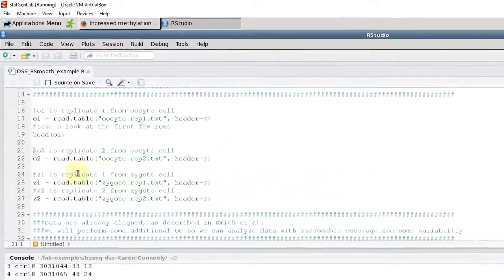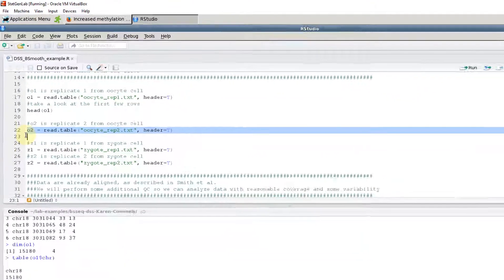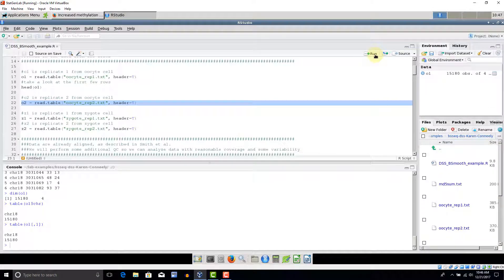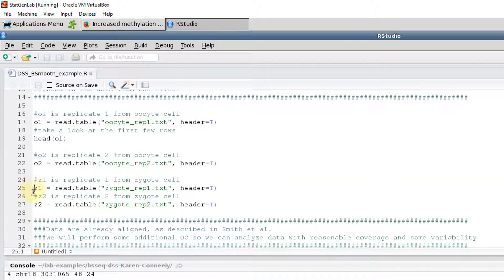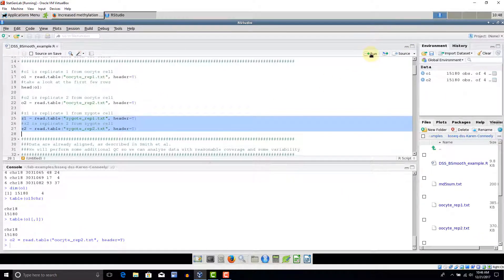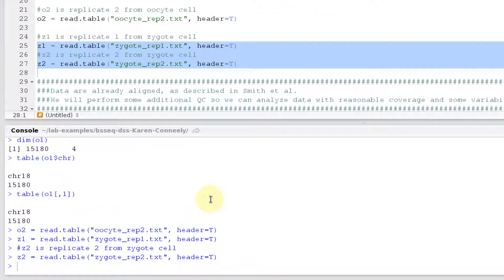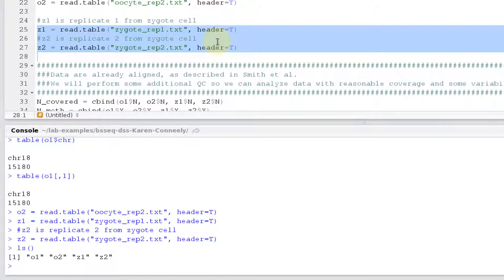That was just the first sample. We have three more samples to read in. We have the second oocyte replicate, and I'll run line 22 to read it in. Then we have two zygote replicates, which I'll read in and name Z1 and Z2. Now we can use the ls command, which lists all objects in our environment. As expected, we now have four objects: the data from each of the two oocytes and the two zygotes.